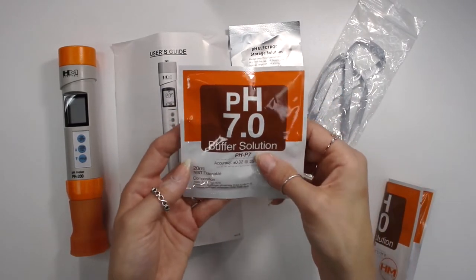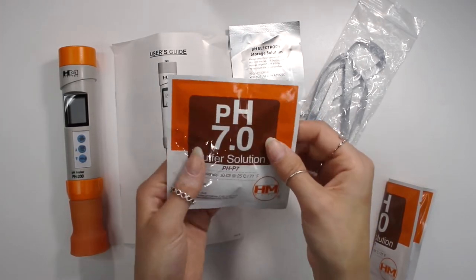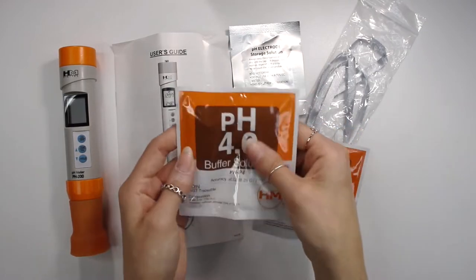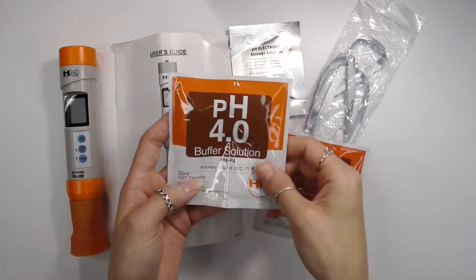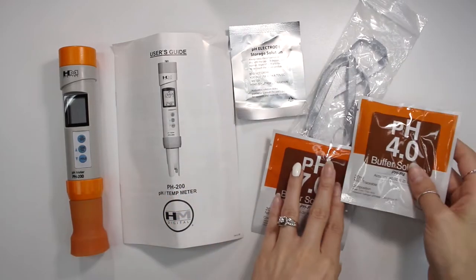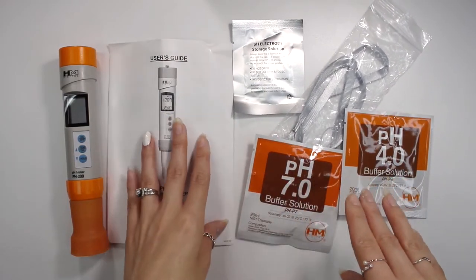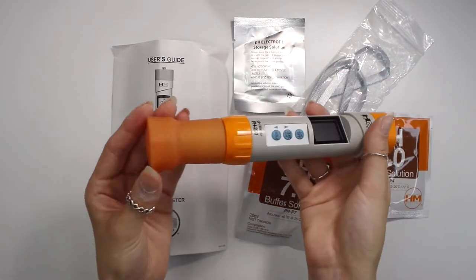It also comes with a pH 7 buffer solution that is pre-dissolved, and a pH 4 buffer solution. Typically when I get buffer solutions they come as a powder that you dissolve in distilled water, so I really like how these are already pre-dissolved. You can also repurchase these pH buffer solutions and the electrode storage solution over on Amazon — I'll link both of those down below. So this is what the pH meter looks like.